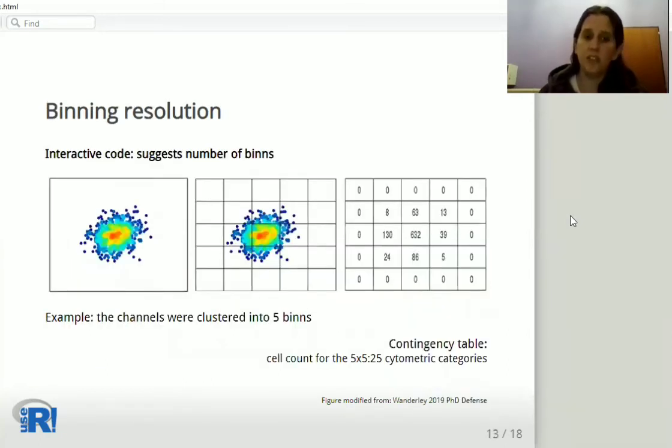FlowDiv uses an interactive code that suggests the best number of bins for channel clustering. In this example, the channels were clustered into five bins, and the contingency table shows the cell count for each cytometric category.